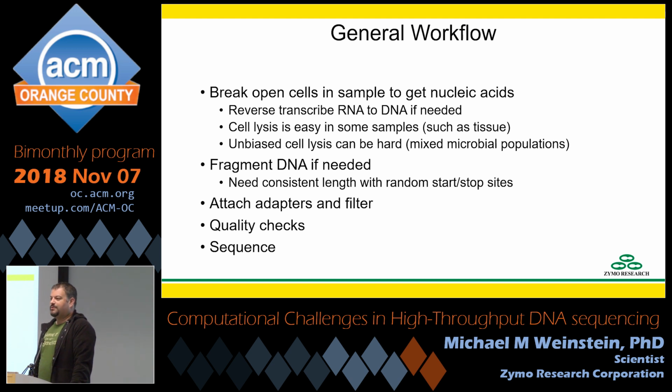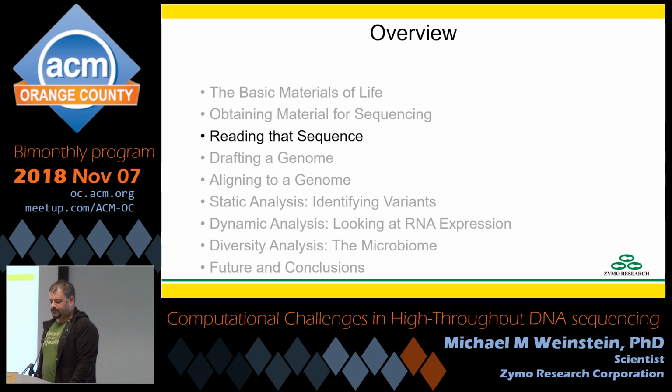Once you've done that, you'll probably want to do some quality checks. Just make sure that your DNA doesn't look degraded or garbage or like it's all fragmented up in the wrong way. And then once you're pretty confident you have adapterized DNA of good quality, that's when you sequence it. So this is where I transition from talking about the squishware to the hardware. So, reading that sequence.